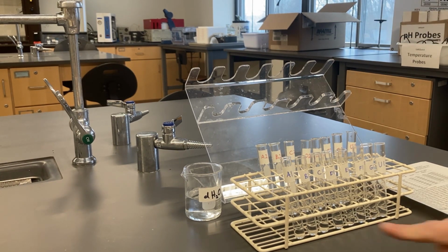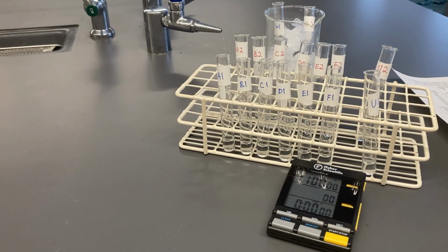All right, and you can see they're all just about 1,000 microliters. All the test tubes aren't the same exact size, but I can see I've added exactly 1,000 microliters to each one of them with the combined solution and water, and I'm ready to do my testing now. All right, I put the test tubes G1 and G2 on ice, so they'll be done at a lower temperature, and we're about to start the reaction.